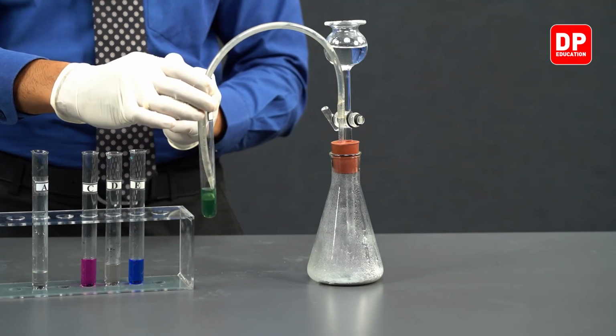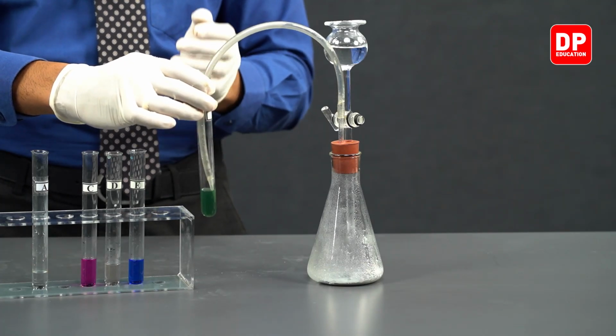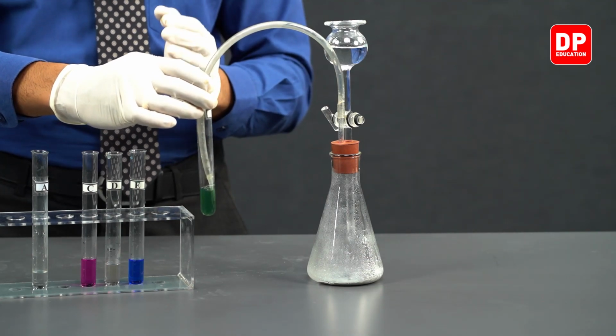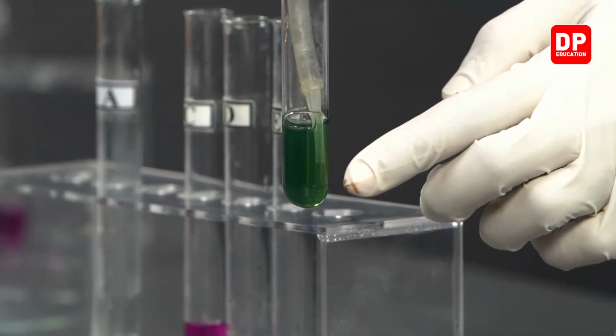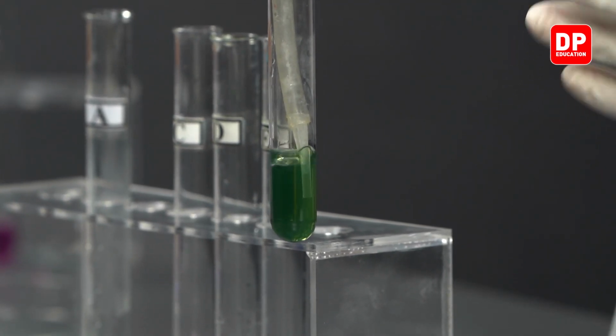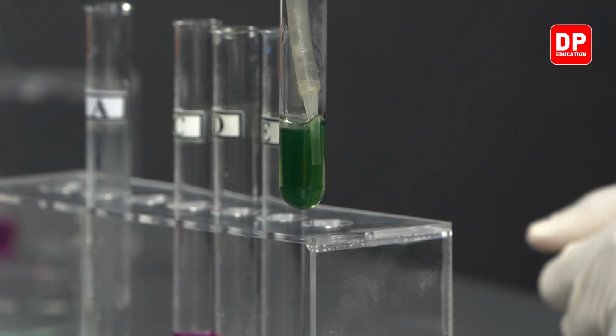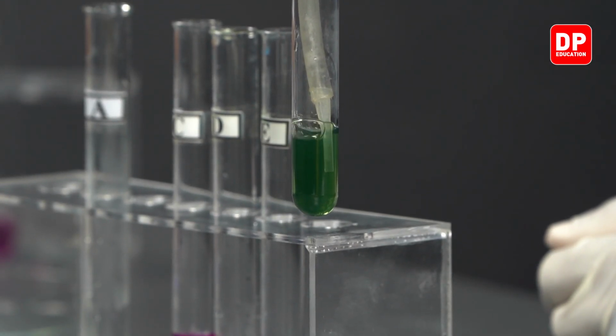This green color is there due to the formation of manganate ions. Permanganate ions are purple in color. However, manganate ions are green in color. That is why we see this green color that is formed here.